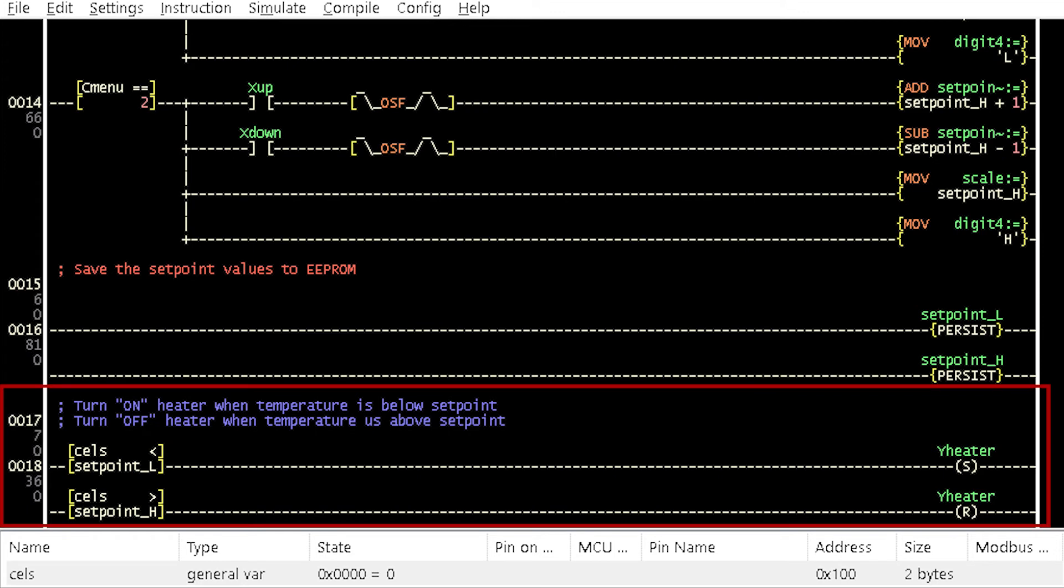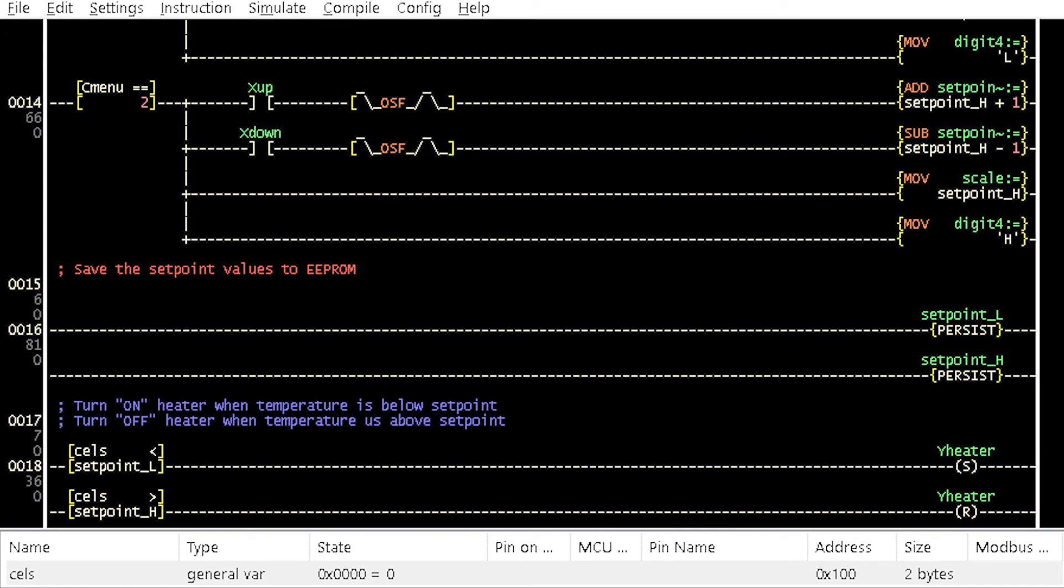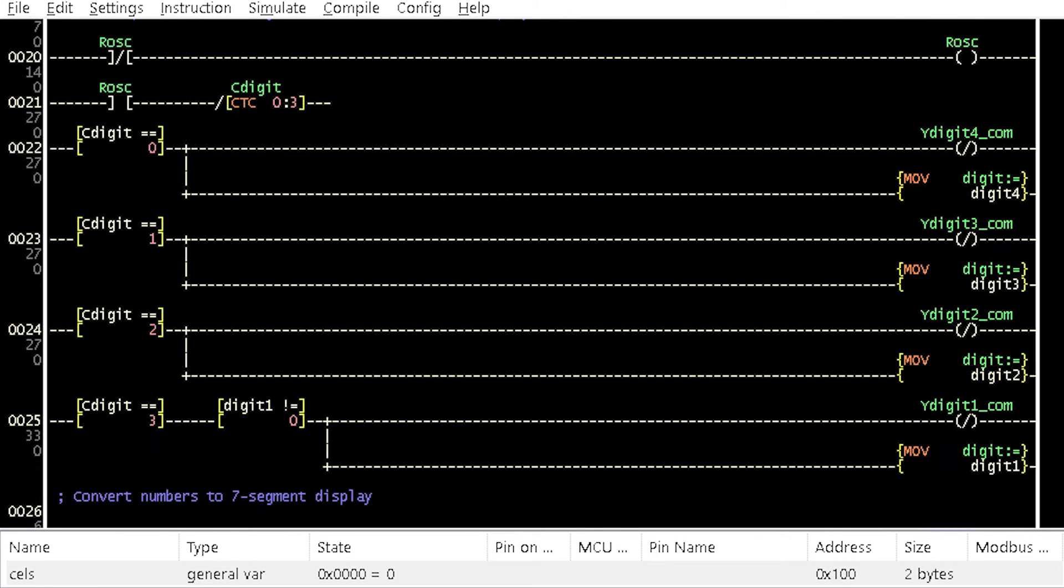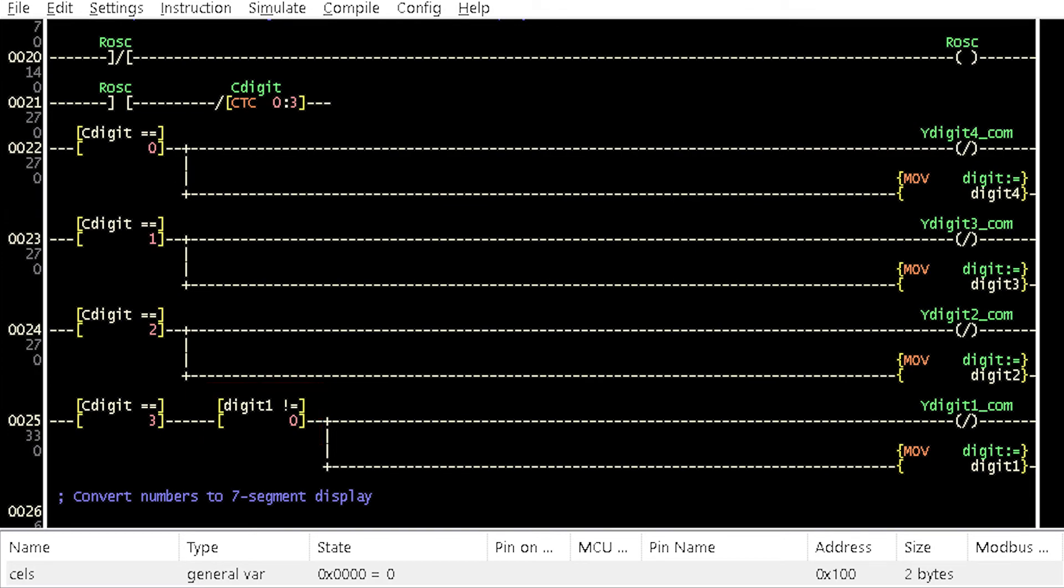The RUN coil ensures the incubator temperature is between the higher and the lower setpoints. It turns on the heater when the temperature goes below the lower setpoint and turns it off when it goes above the higher setpoint.